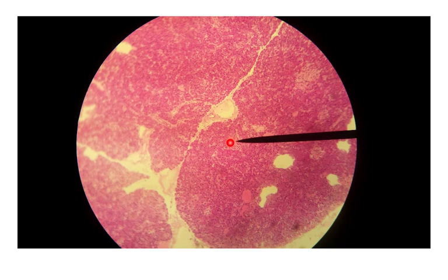And the islets of Langerhans, even though we can't tell visually looking at them, there are two different cell types. There are something called alpha cells, and others called beta cells. The alpha cells make something, a hormone called glucagon. And the beta cells make the hormone that practically everyone's heard of, insulin. So those are the two hormones that are involved chiefly in maintaining your blood glucose levels.